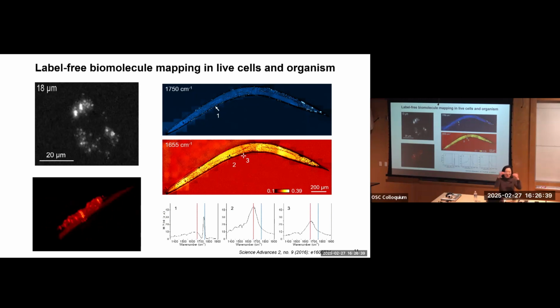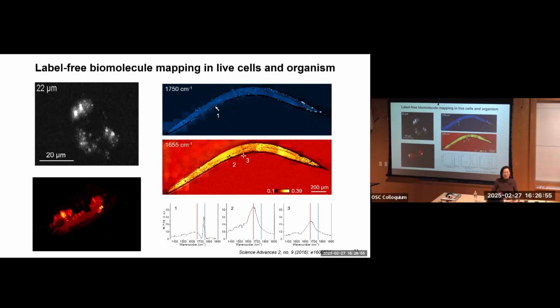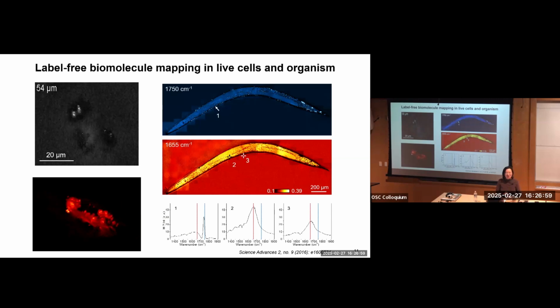So we can now focus tighter using visible light, and achieve tighter focus in Z compared to conventional IR imaging. We also quantified that using this setup: the XY resolution is a few hundreds of nanometers, and the Z resolution is a few microns. Just what you would expect from visible microscopes.